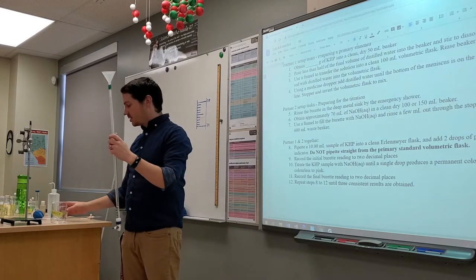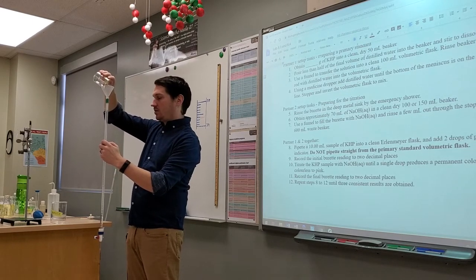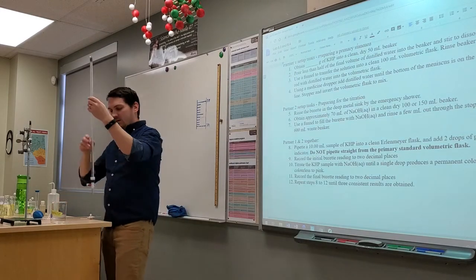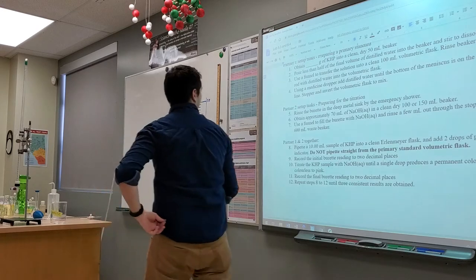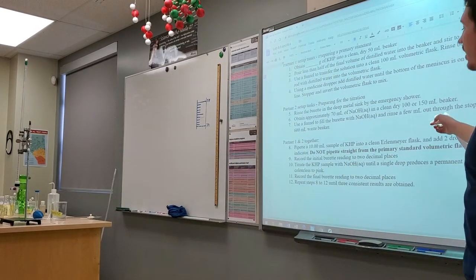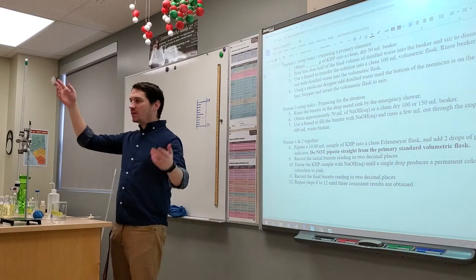Now that we've rinsed it, now we can properly fill it up. So let's fill it up as much as I can here. That's how much sodium hydroxide I have left, whatever. So I've properly cleaned and rinsed out my burette, and that's perfect, no problem. Obtain approximately 70 milliliters of the sodium hydroxide. And then you're going to use a funnel to fill the burette and rinse a few milliliters out. Good. Perfect. So we've got this filled up about as high as we care to, right?